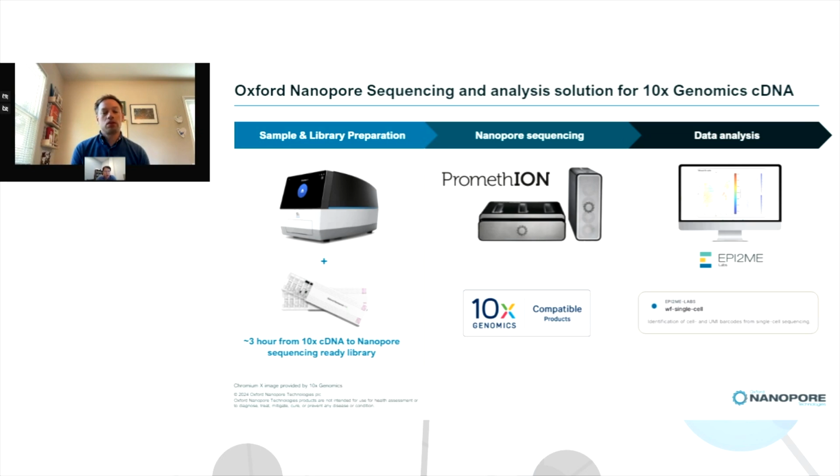So we don't use sequencing by synthesis. We don't do cluster amplification. And because each nanopore sensor can read thousands and thousands of molecules one after another, we don't do any kind of concatenation, and we can still utilize the system efficiently.